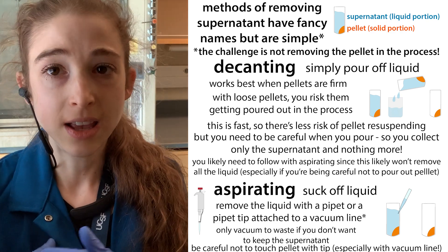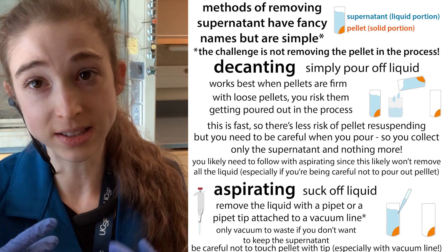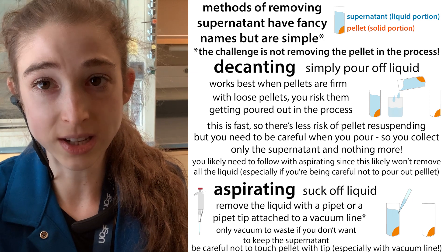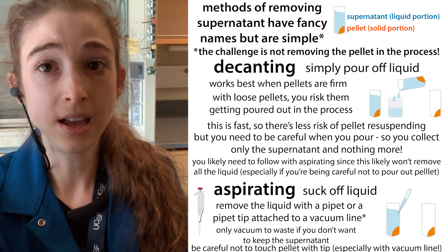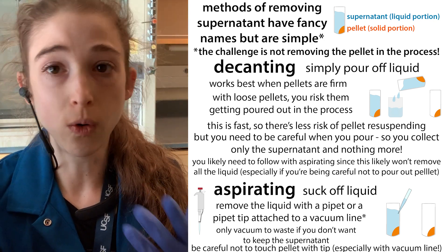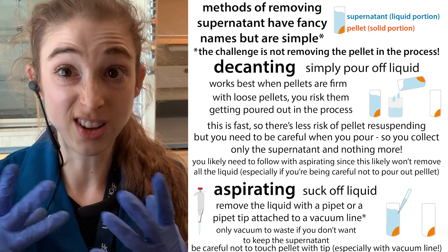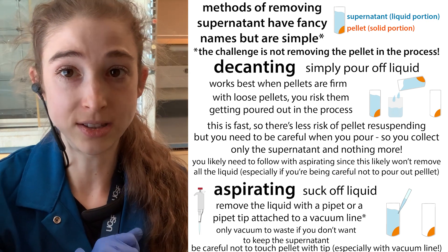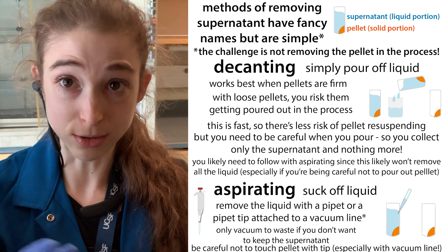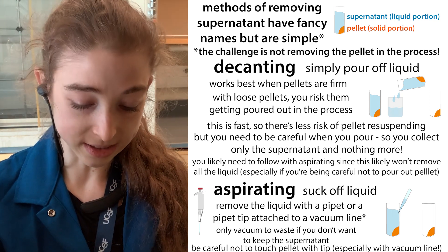Make sure you're not disposing of the supernatant if you need it, or the pellet if you need it. It's always a good idea to keep both anyway until the end — just to confirm that your protein or target actually pelleted out versus staying in the supernatant. This is especially important when doing an experiment for the first time.